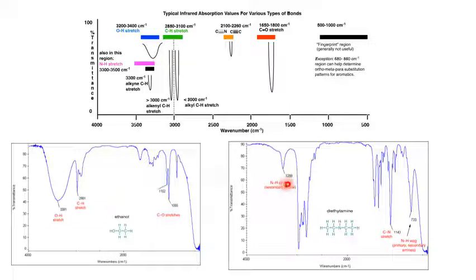Now this NH stretching frequency, I have already talked about, but there is another band, this 733 centimeter inverse. This is the NH bending mode, wagging. This NH wagging is one of the bending modes of this NH, and this is a stretching. Always remember that stretching frequency is higher in energy and bending mode requires lower energy. So stretching mode always falls in the higher energy, higher wave number region compared to that of the bending mode.